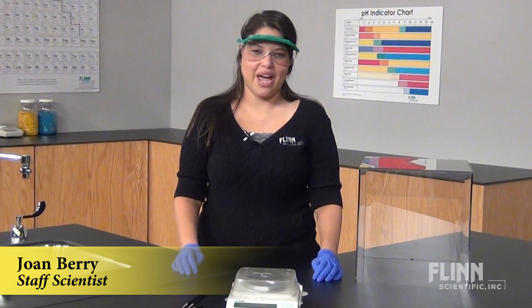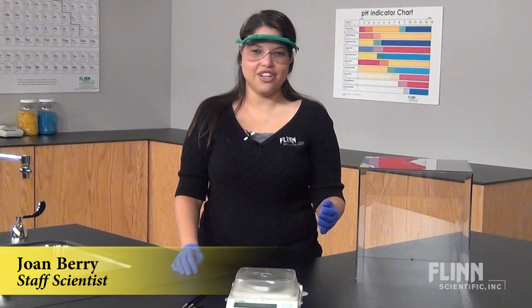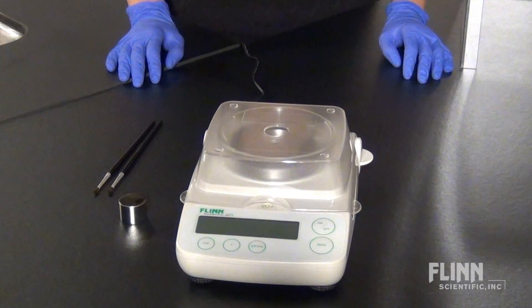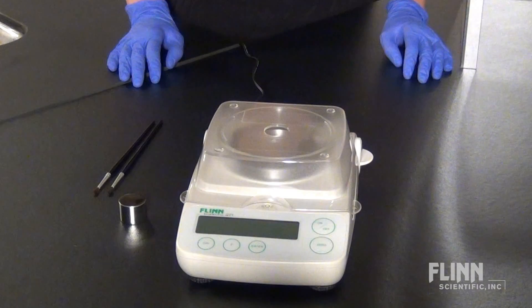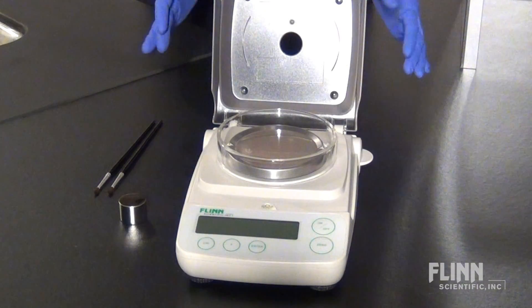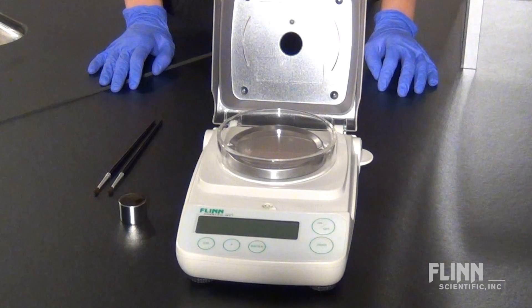Your milligram balance is a valuable tool in your lab. Here are some tips on how you can get accurate and consistent readings. First, place the balance on a stable and level bench top surface away from vents and any other equipment that may cause vibrations or electronic interferences.